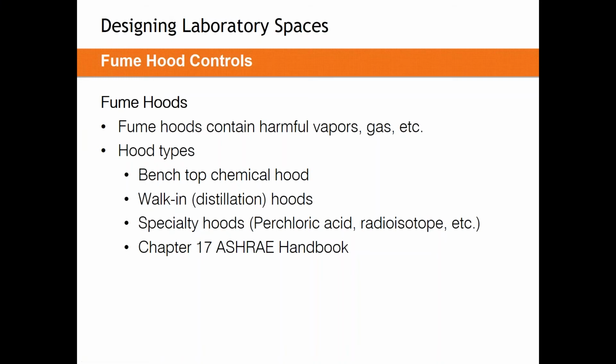There are a few different fume hood types. Probably the most common that you'll see and the one that most people picture is the benchtop chemical hood, but there are other types. There are walk-in or distillation hoods. There are some specialty hoods like perchloric acid hoods and radioisotope hoods. Chapter 17 of the 2019 ASHRAE Handbook gives a really good breakdown of all of these hood types. I think there's 12 or 15 different types, and it breaks them all down very succinctly and very, very clearly. I do recommend you give that a read if you'd like to know more about the different fume hood types.